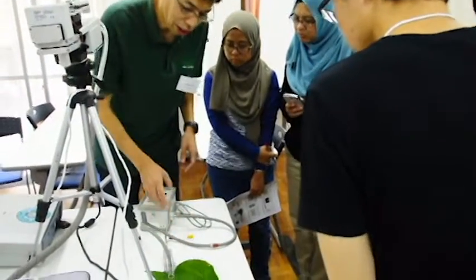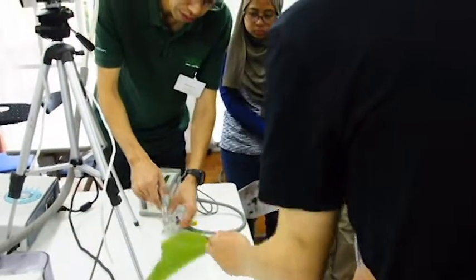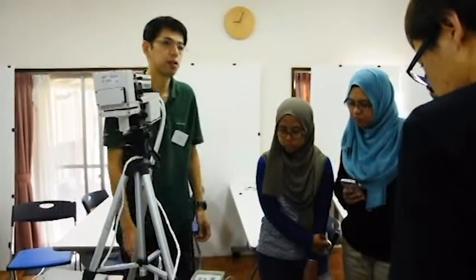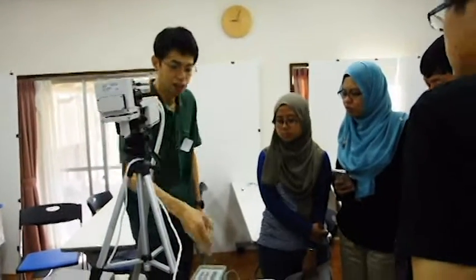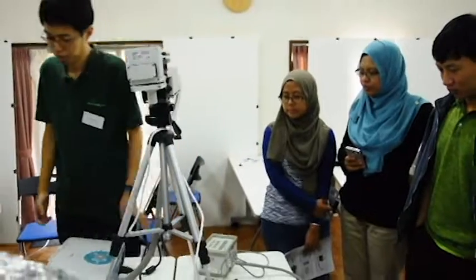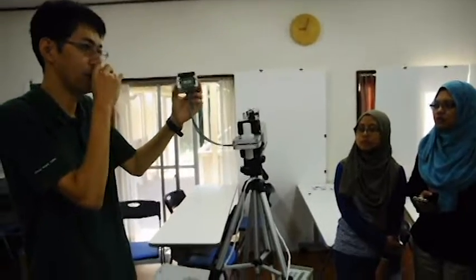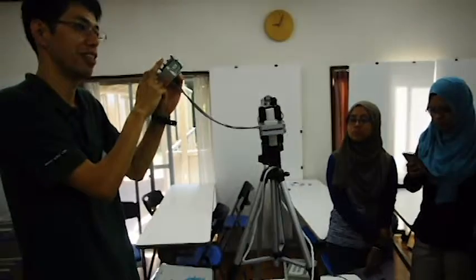And please be careful that this system illuminates a very strong light. The intensity of this flashlight is about 5-fold higher than the sunlight. So if you look at this flashlight directly, like this, your eyes are injured. Okay. The price of this light source is 2 million, because the chlorophyll fluorescence system is included in this.